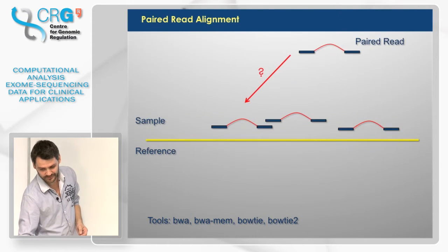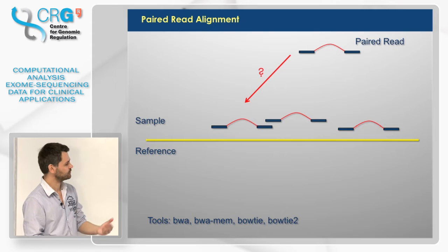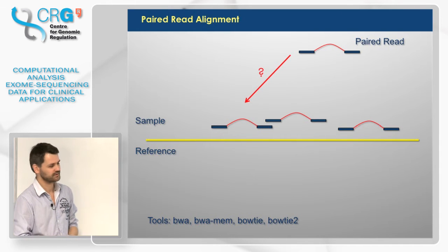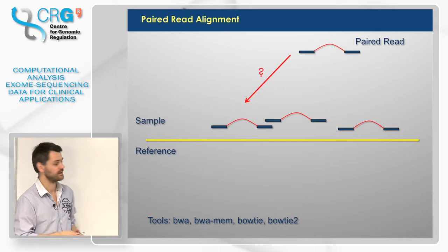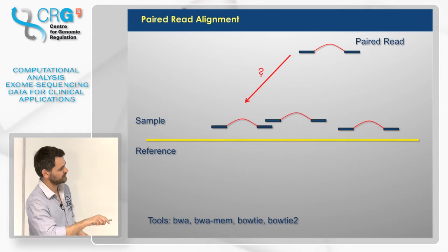In paired end sequencing, there's an additional problem. You place your first read and you place your second read, but then afterwards you want to check that they have the distance between them, which you expect from your sheared fragment size. So if the second read falls on a different chromosome or far away, you know there's something wrong. This fragment cannot be from there, or there was a deletion or insertion or some big event. It could also be an inversion. Then you would see this read doesn't look in the right direction. So it would change.